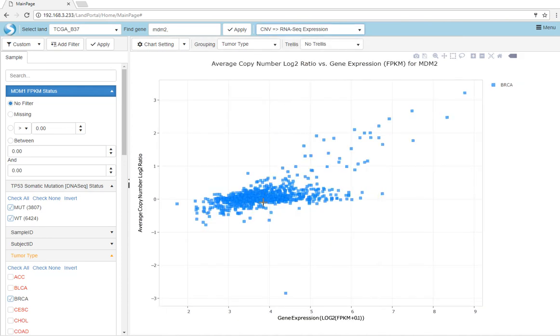We can see that samples with high expression correlate well with high copy number.